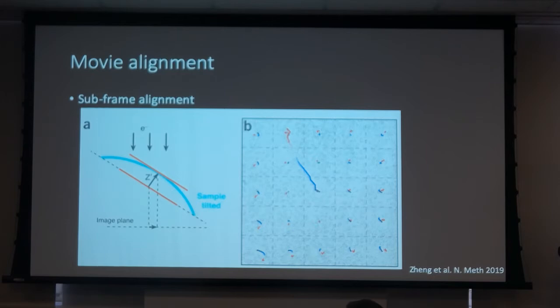All right, so that's at the micrograph level. It's something you can do straight away in your workflow. And the better you do it, the better it is for every successive step. So better use the best algorithm for that. MotionCor2 is one of those, which now works very well. Another one is called Warp, Warp-EM by Dmitry Tegunov, that does a very similar approach. CryoSPARC also now implemented the same approach. So you can choose between those.